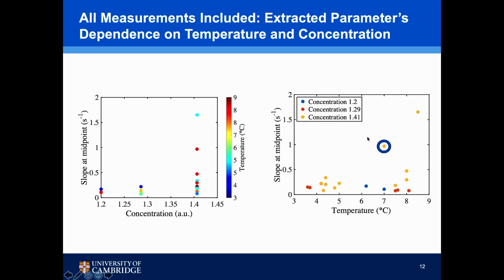While for some of them we got outliers, as circled over here, that's because we see crystals immediately when we inject the solution, possibly because we already have seeded the solution when we inject it. That's why the crystal starts to grow immediately. So for now, we can see terahertz spectra were linked very well with the image analysis, and we can see the crystallization process along the time, but that maybe can be achieved by other methods as well.